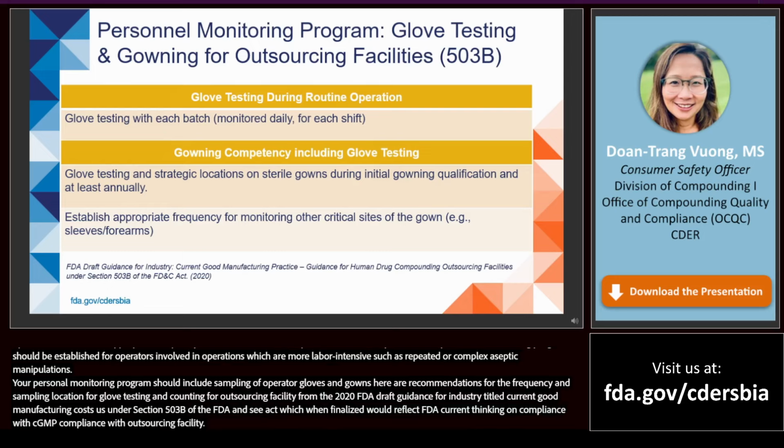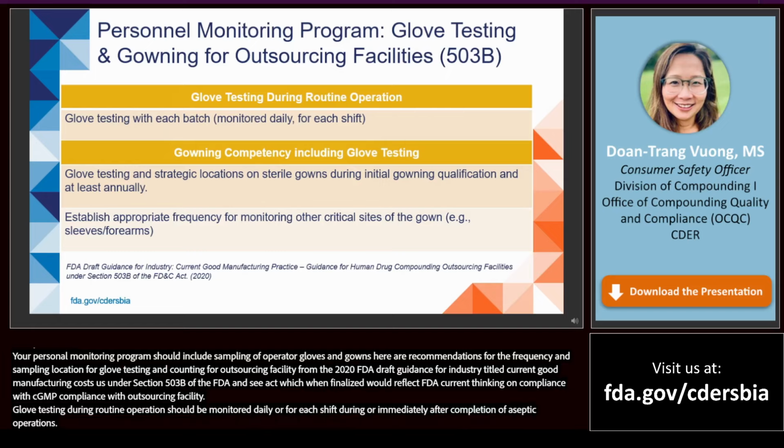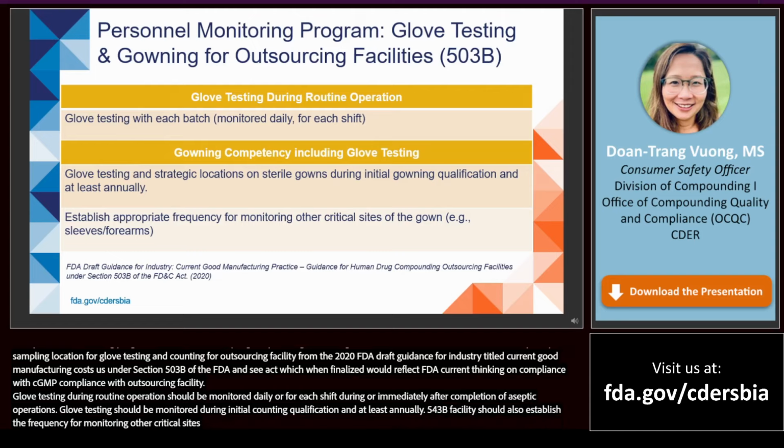Glove testing during routine operations should be monitored daily or for each shift during or immediately after completion of aseptic operations. Glove testing and selected locations on sterile gowns should be monitored during initial gowning qualification and at least annually. 503B facilities should also establish appropriate frequency for monitoring other critical sites of the gown, such as sleeves and forearms, during or immediately after completion of aseptic operations.